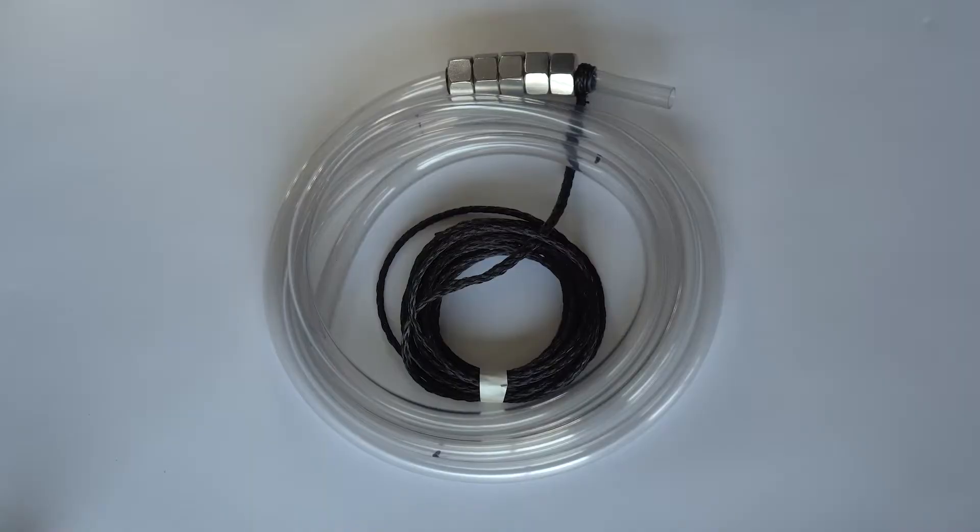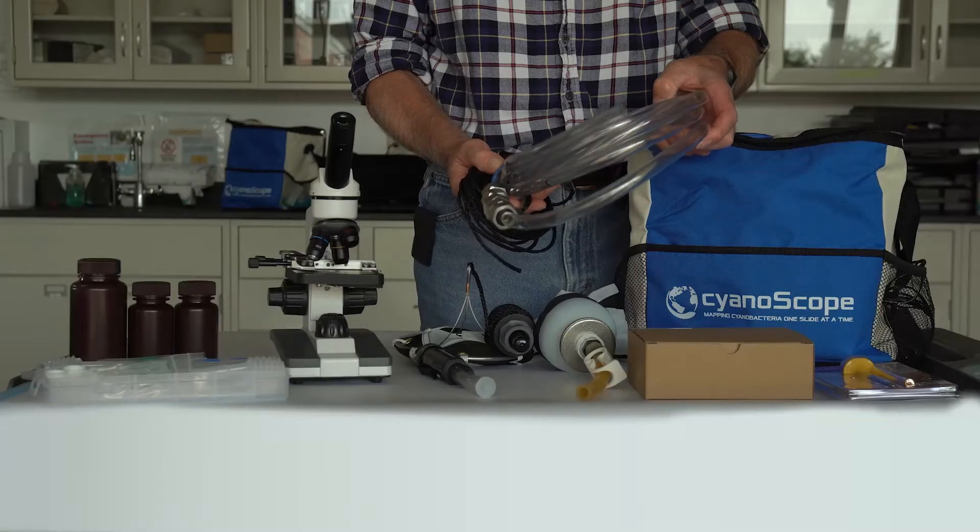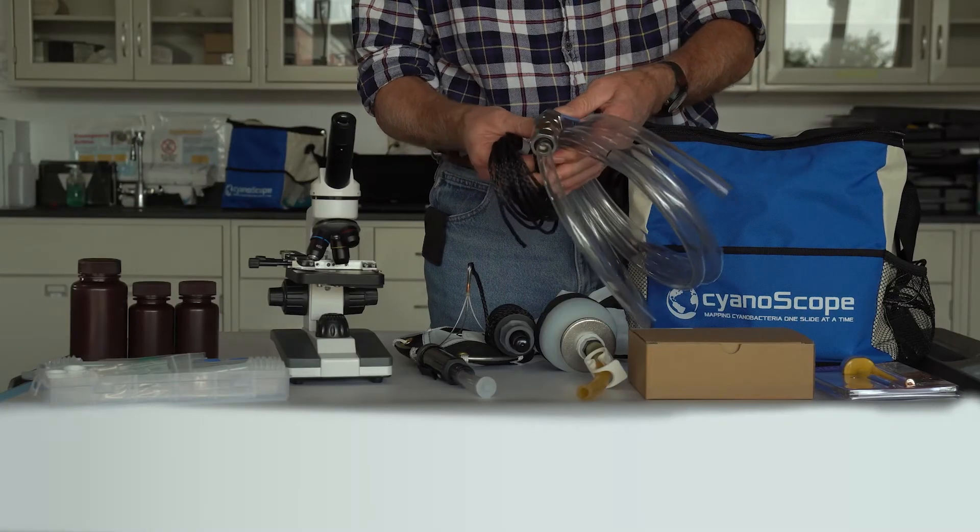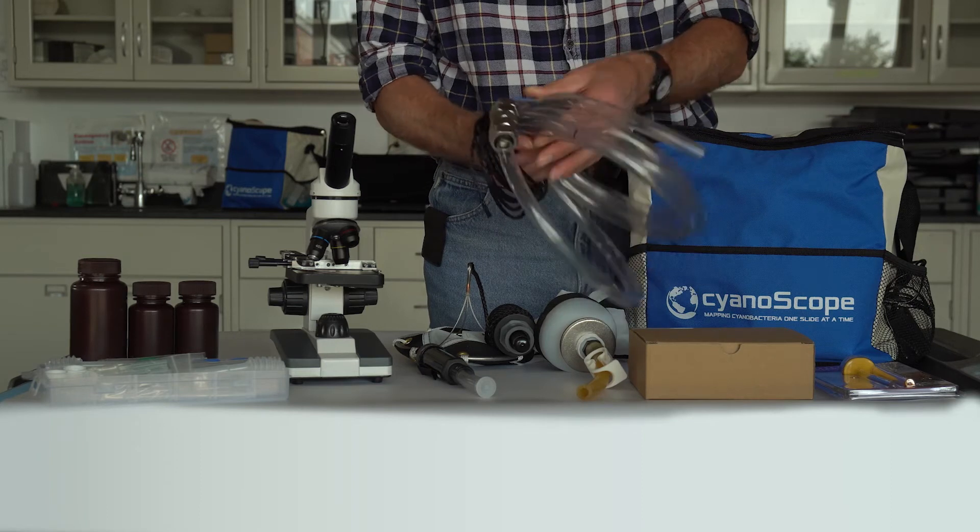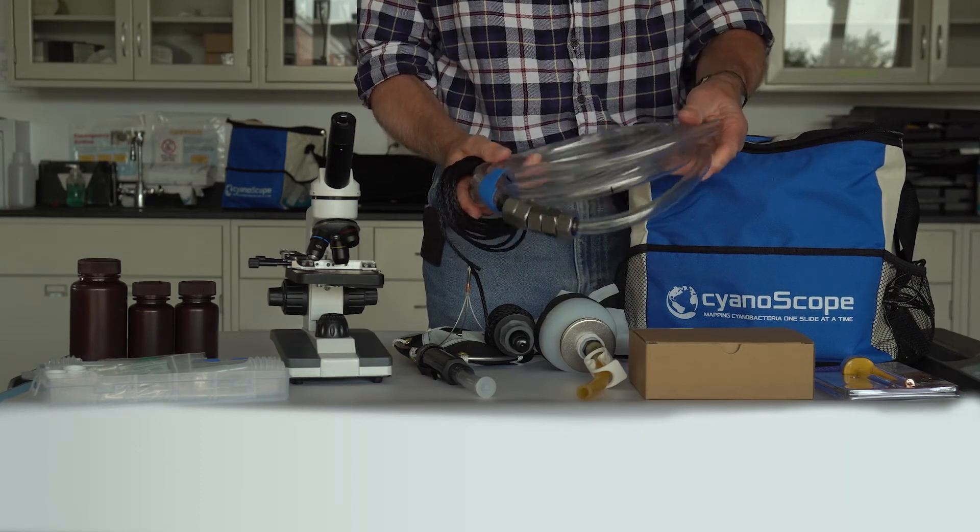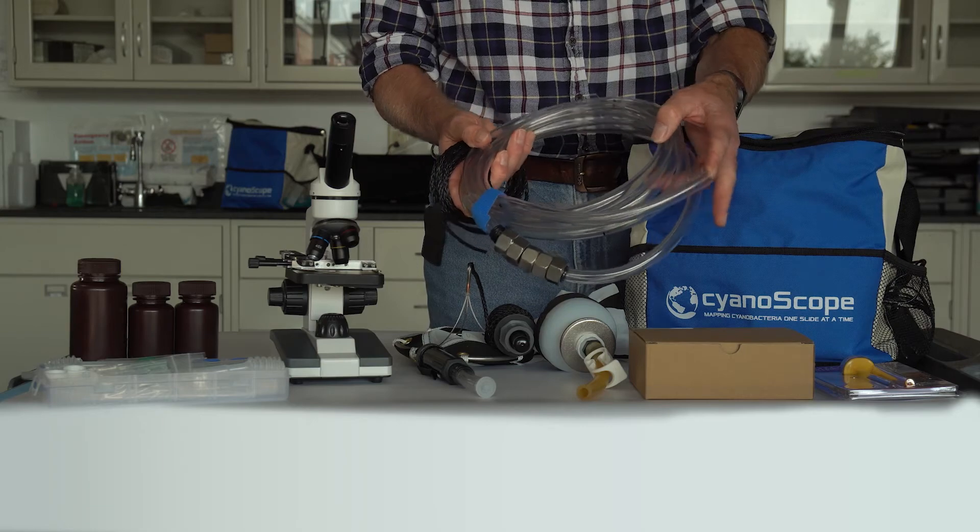The integrated tube sampler will collect a sample that reflects the concentration in the water column. To help with measurements, the tube has markings indicating depths of 1, 2, and 3 meters. Again, be careful not to send the tube in so deep that it makes contact with the bottom of the water body.